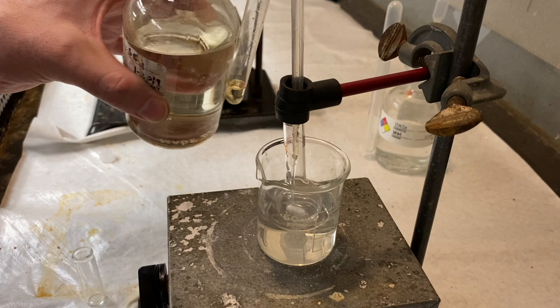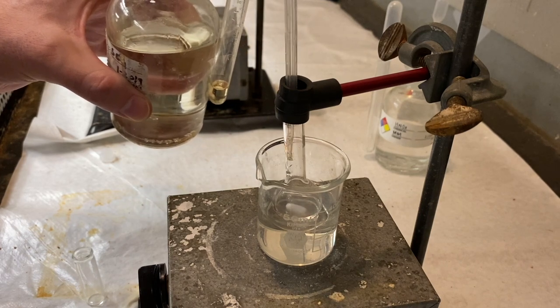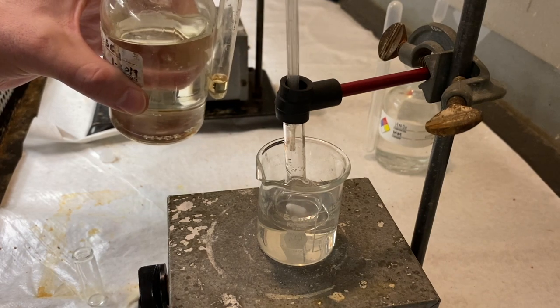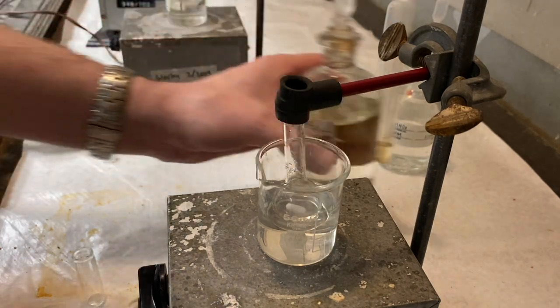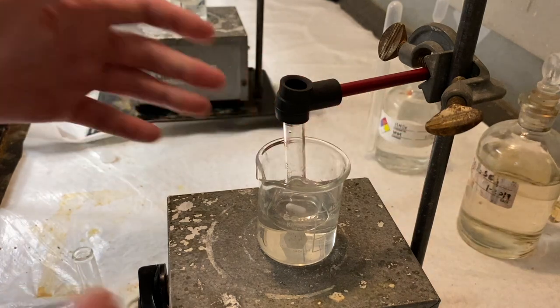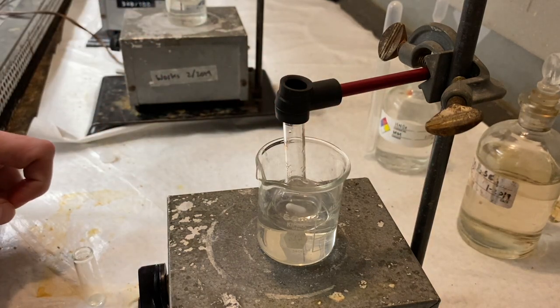You'll know pretty quickly that you've got it on your skin. And you'll be able to wash it off very, very fast in the sink. And you probably won't get that much damage to your skin.